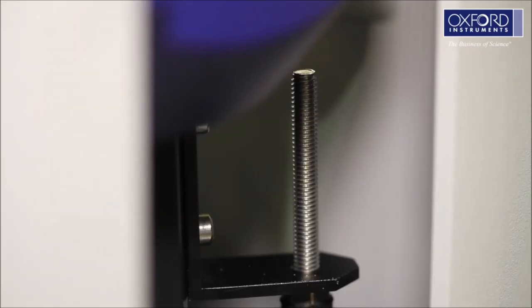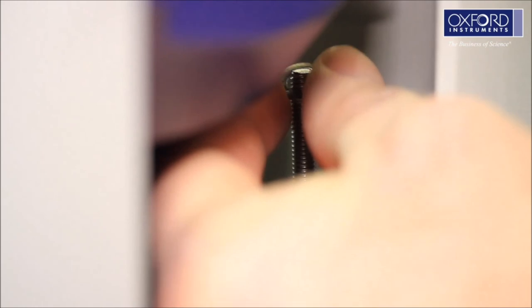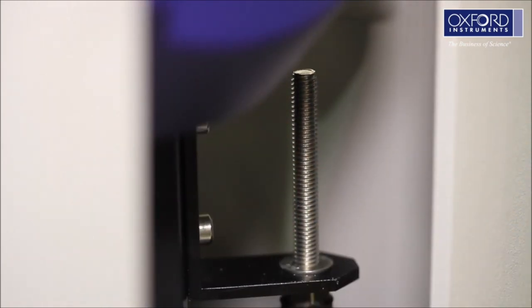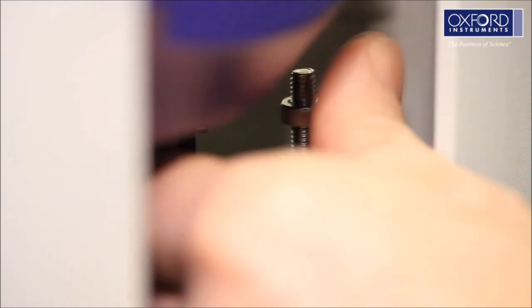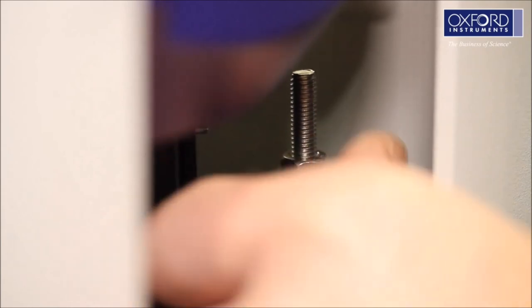Refer to the system manual if in any doubt. When the cryostat is safely in position, replace all four M6 washers and nuts. There is no need to fully tighten these at this stage — finger tight is fine.